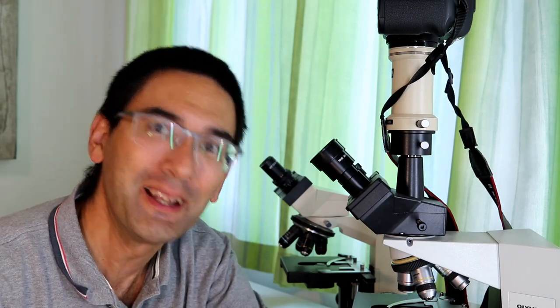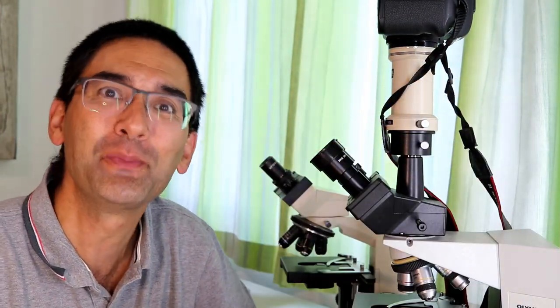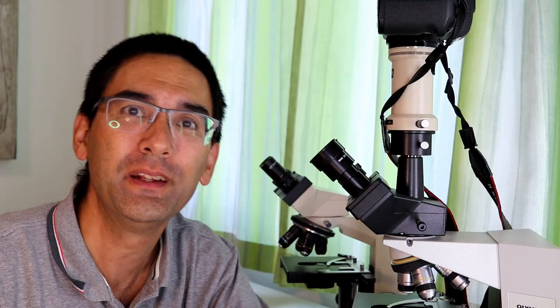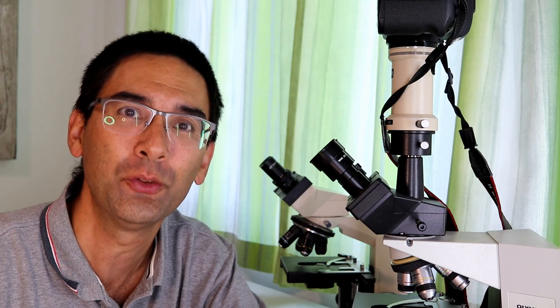Well, today it feels again a little bit like Christmas. I ordered something and got a little box. What I want to do now is unpack it and have a look at it. It happens to be a slide ringing table, and I'm also going to show you later in the video how to use it and what you can do with it.